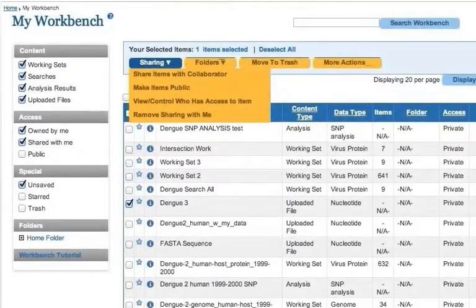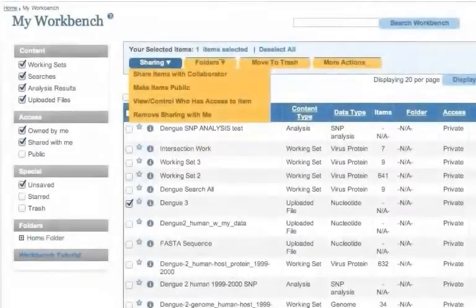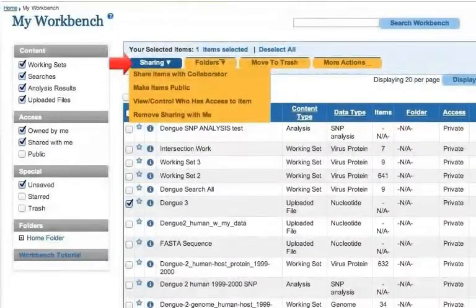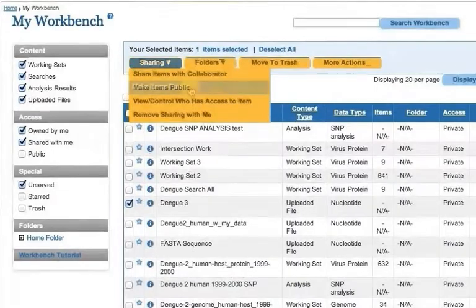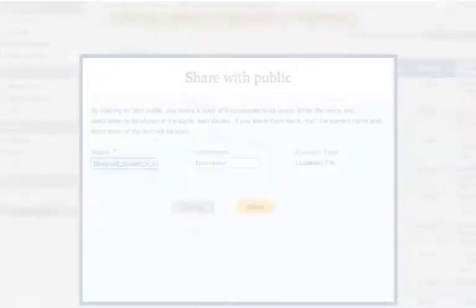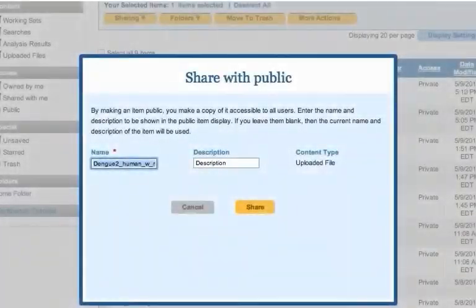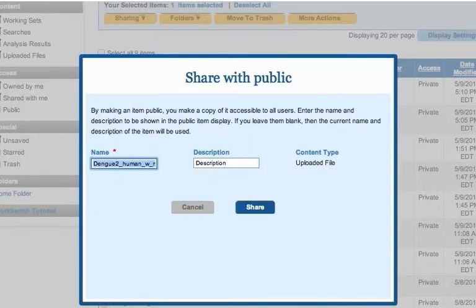If you want to share a copy of an item with all system users, for example after using a working set in a publication, mouse over the Sharing button above the main workbench table and click Make Items Public. Type the name and description that you would like others to see when they access this working set, or leave these text fields blank to use the name and description currently found in your workbench. Complete the process by clicking the Share button.